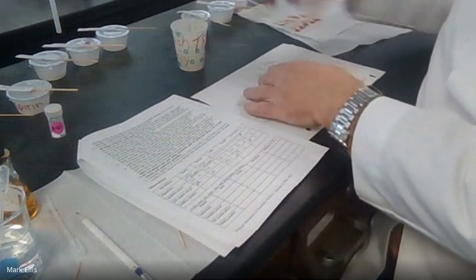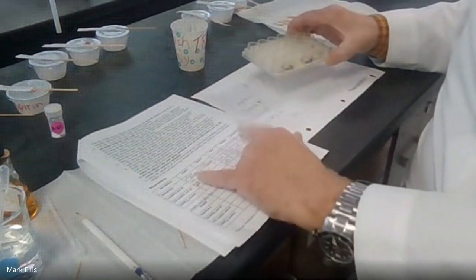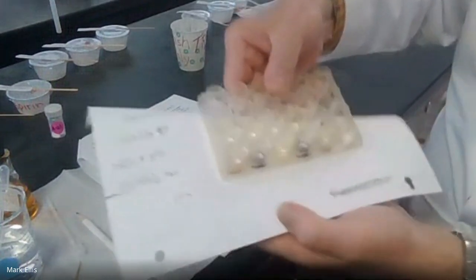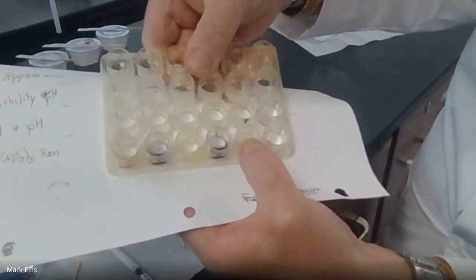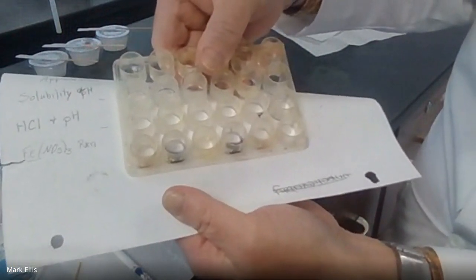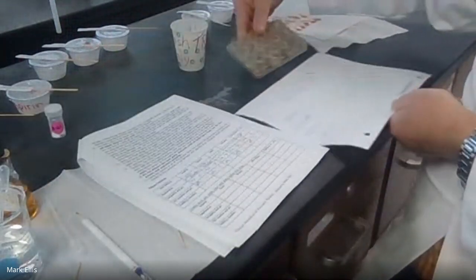So from the test one, with the solubility and the pH, I narrowed it down to aspirin and Excedrin. And now when I compare, this is my unknown, this is the Excedrin. They look nothing alike. Let me see if I can get a white piece of paper up here to compare. Here's my unknown, here's the aspirin. Those look pretty similar, and that was one of the ones I narrowed it down to in the solubility and pH. So I'm going to judge that this is aspirin.